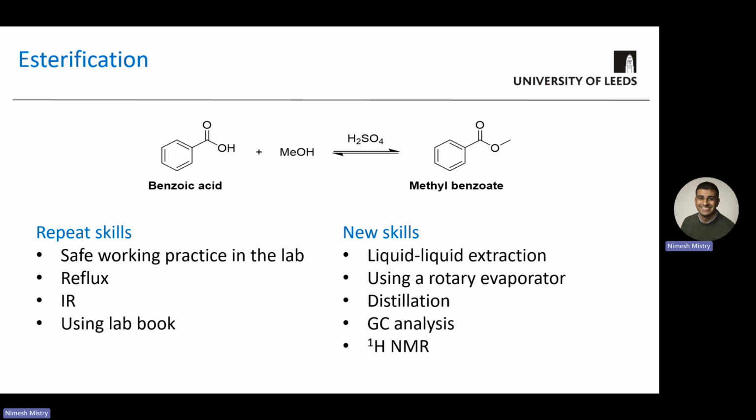So the purpose of doing this experiment is to give you repeated practice of these key skills. In particular, this is another reaction that needs to be set up and run under reflux. But this experiment is also going to introduce to you a lot of new key skills that are used in synthetic chemistry experiments as well. Liquid-liquid extraction, for example, is one of the main ways that we purify mixtures in organic chemistry experiments, and distillation is one of the main ways in which we purify liquids as well.